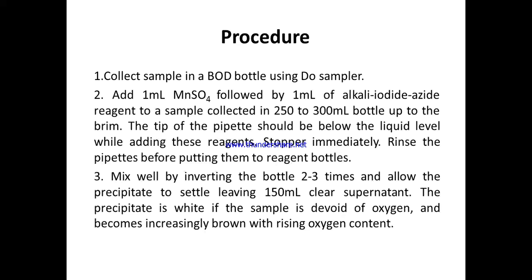Okay, what is a precipitate? When a solid does not dissolve in a liquid, it settles down at the bottom. Don't get confused with hydrology precipitation. Okay, I am not talking about that. In chemistry and environment lab, whenever you hear the word precipitate in a liquid, that means some solid is being talked about which has not dissolved into the liquid but has settled down at the bottom. An insoluble solid that settles at the bottom, we call it a precipitate.